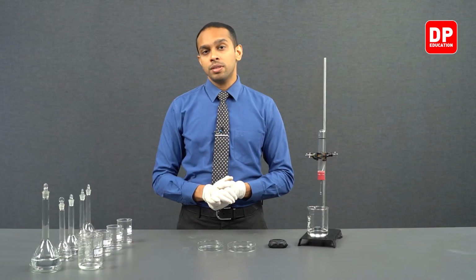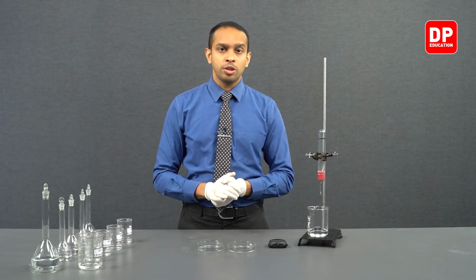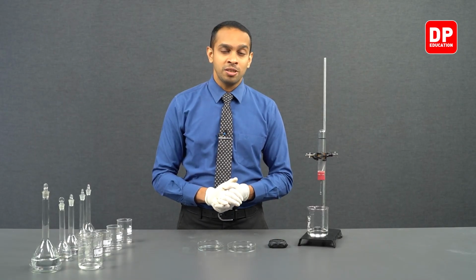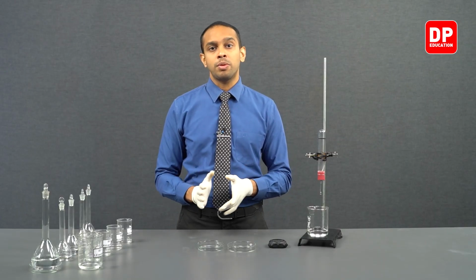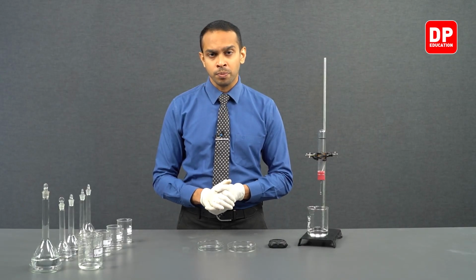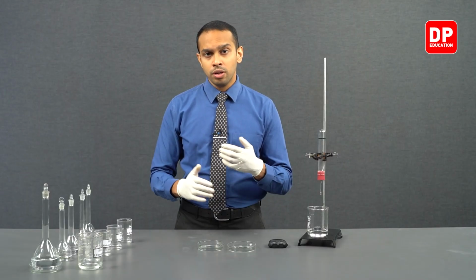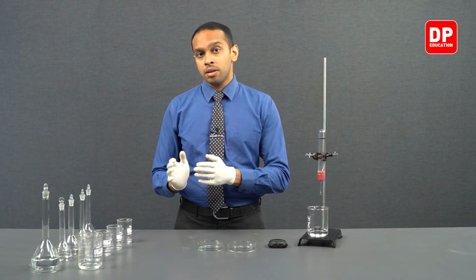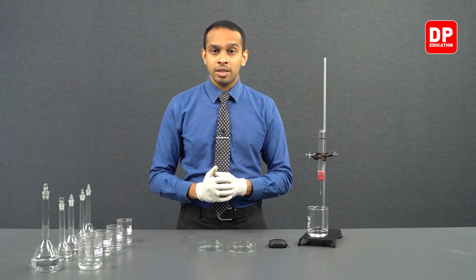Now we have observed how the reaction rate changes when we increase the concentration of the HCl that we have used. Just to give you a summary before we conclude this experiment, we wanted to make sure that we measure the rate of the reaction by measuring the volume of hydrogen gas that is collected here.